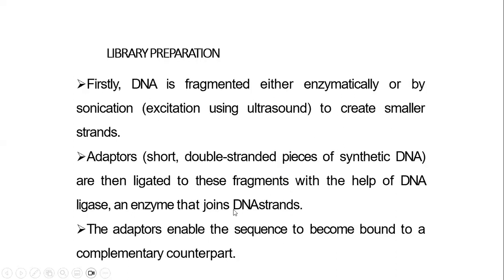Coming to the first step, that is library preparation. So first the DNA is fragmented either enzymatically or by sonication method to create smaller fragments of DNA. Then adapter molecules are ligated to these fragments with the help of enzyme DNA ligase, and the adapters basically enable the sequence to become bound to the complementary sequences known as primers, which are attached onto the surface of a chip that is used for sequencing.